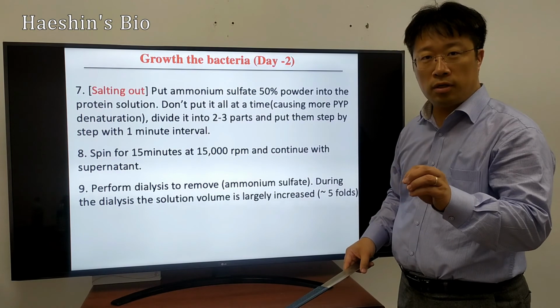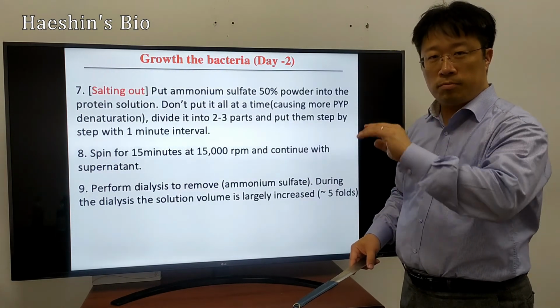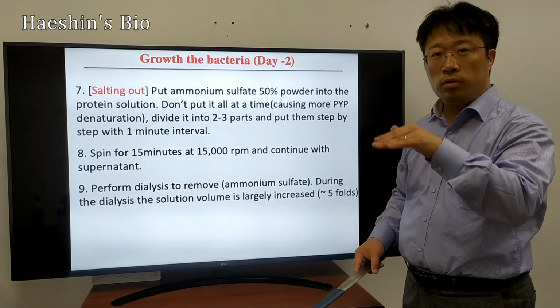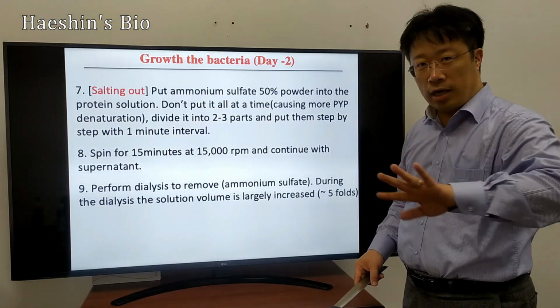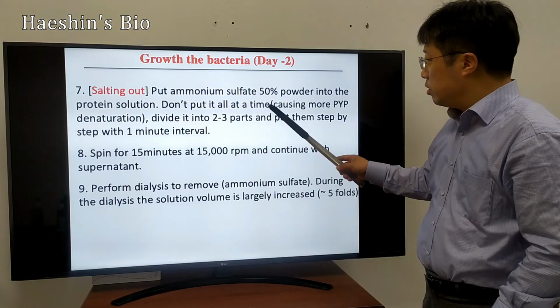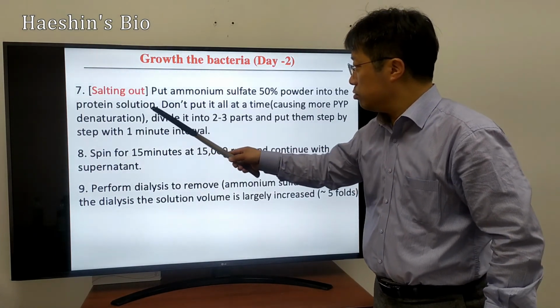will take a lot of water molecules so that among the protein population, the protein that has a low solubility will be precipitated first. So that is basically you're taking the low solubility proteins out of the system, which is quite a high amount, about 50% powder into the protein solution.